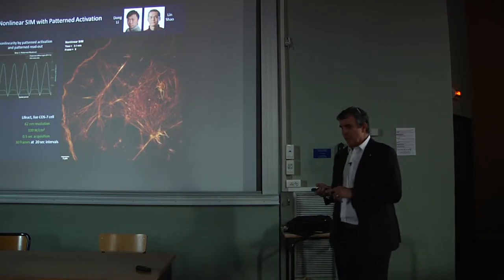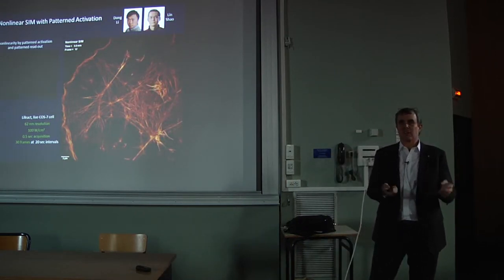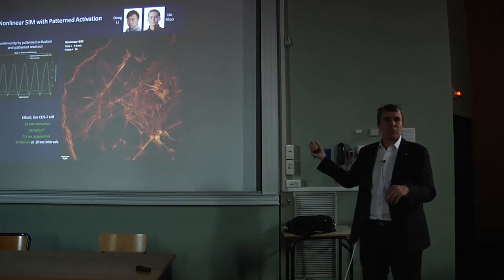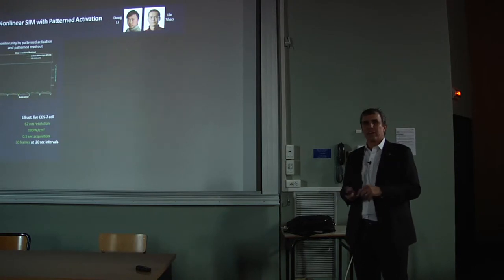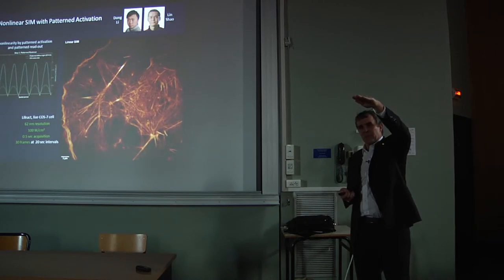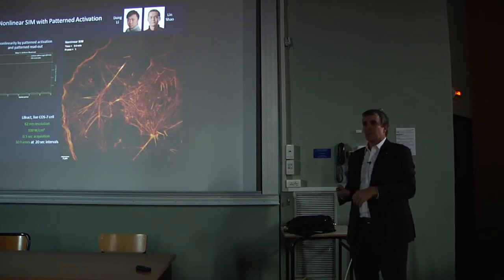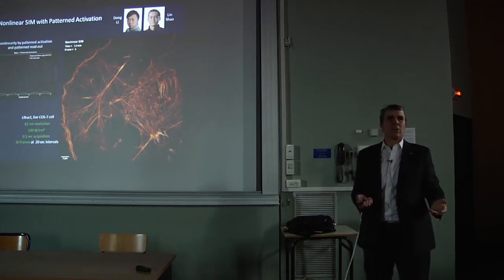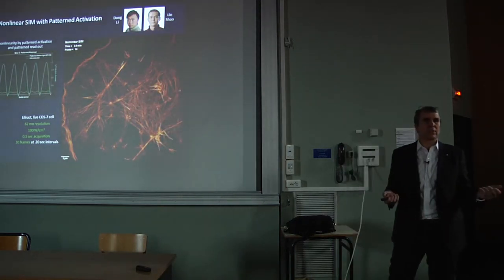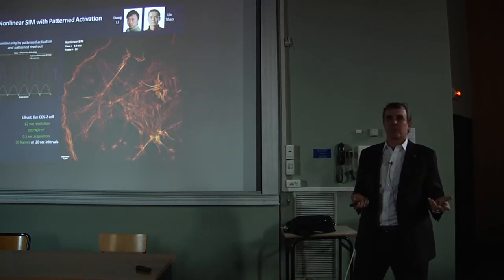What we realized as we thought about that is that this principle of saturated depletion, which is the principle behind the STED microscope and the RESOLFT microscope in the previous form I just showed, is really not a good way to do live cell imaging, because you're taking all of the molecules up to an activated state, and then the vast majority just go right back down to the ground state. When they do that, they're not contributing anything to the image at all, but every molecule can only undergo a finite number of switching cycles before it's going to bleach. And so you really lose your molecular budget quickly by doing that.